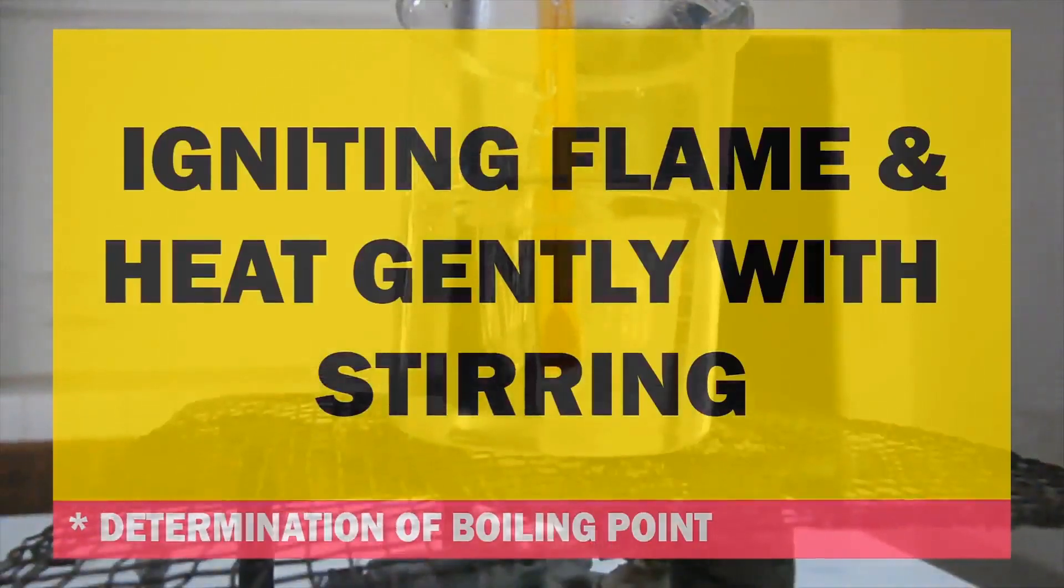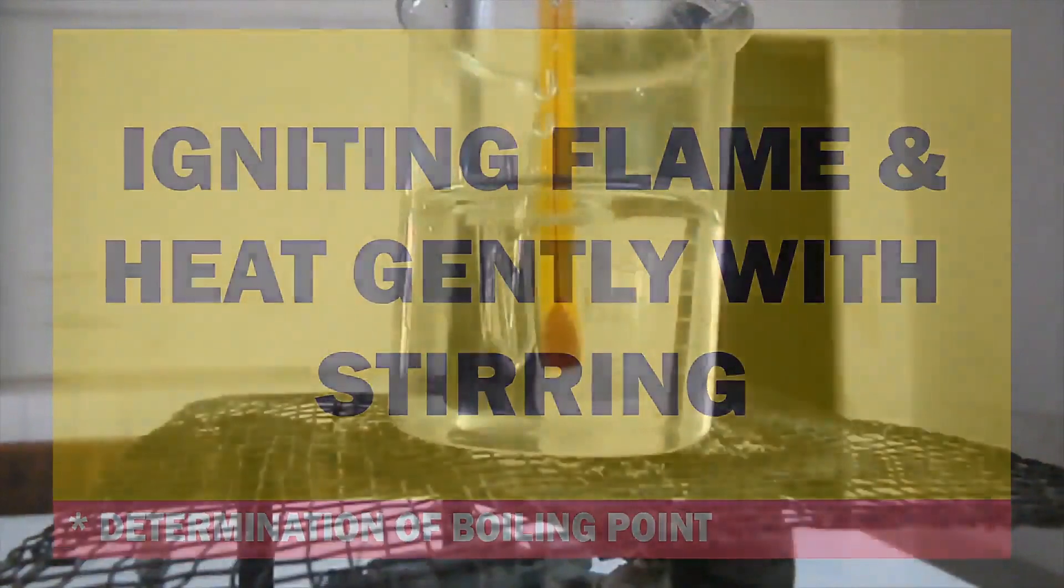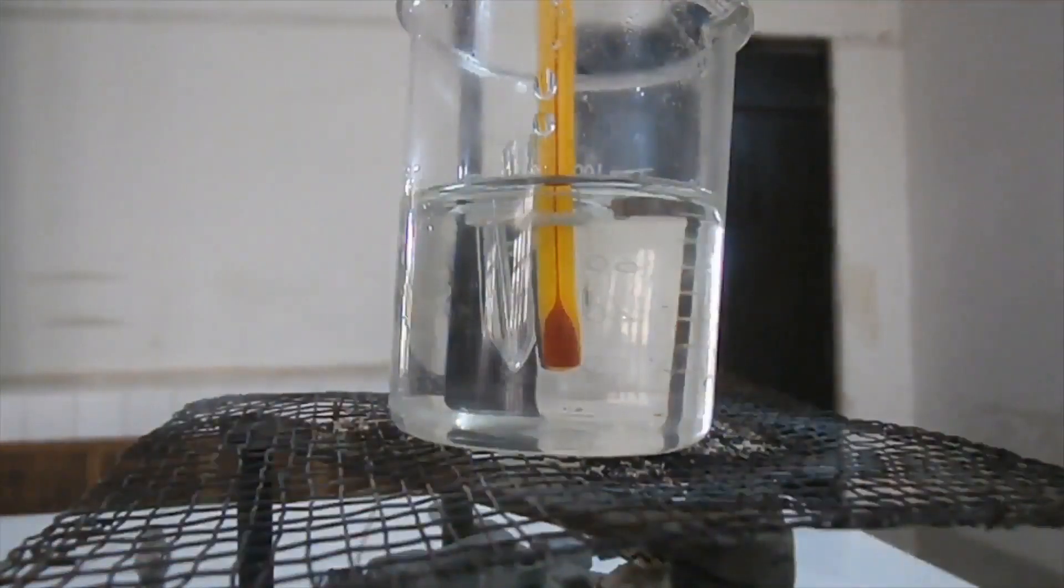Igniting flame and heating solvent bath gently with continuous stirring.